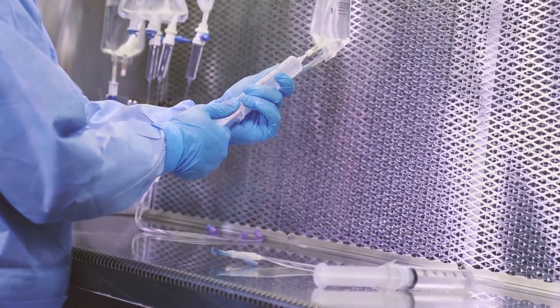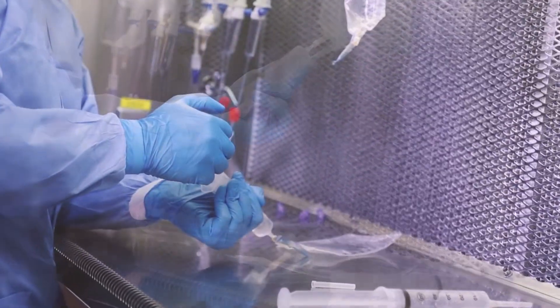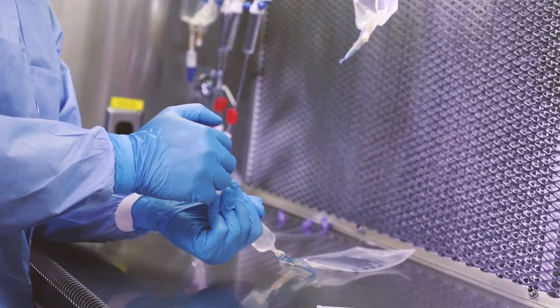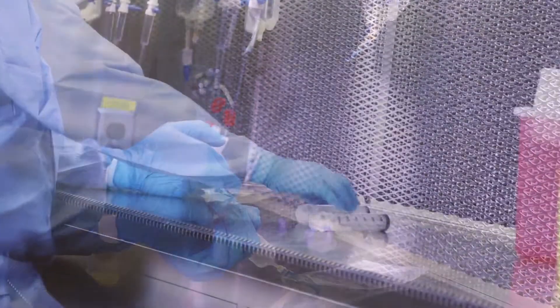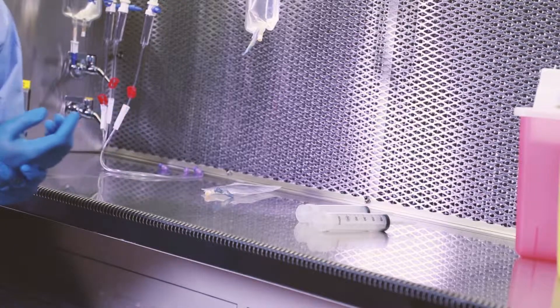The process of making stock solutions of diluted drugs can be tedious and time-consuming. Not to mention, the repetition of strenuous motions can lead to injuries and technician downtime.